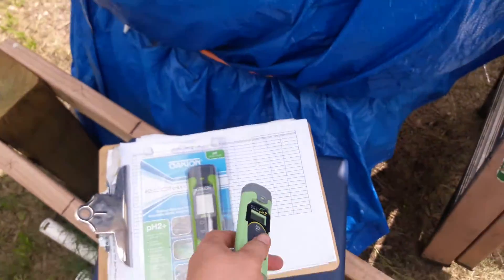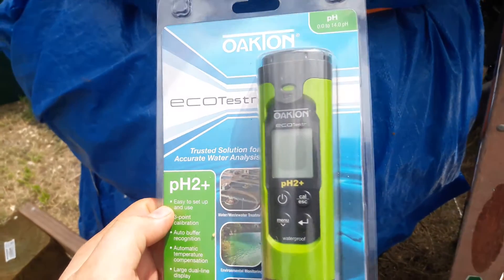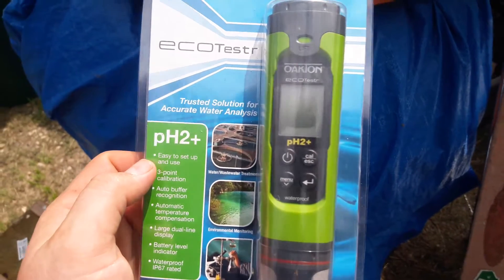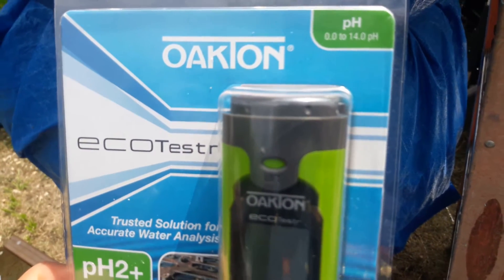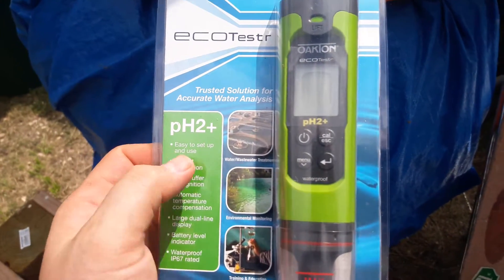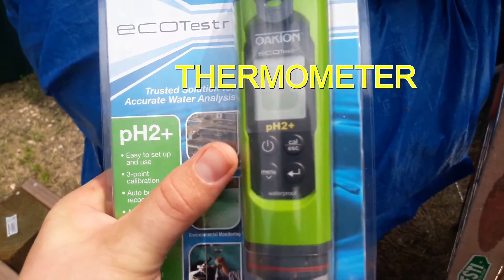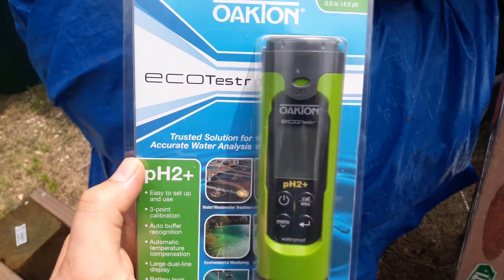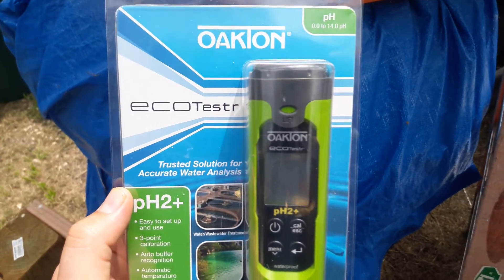We went ahead and picked this one up because it is the most comprehensive pH tester out there. They added features we could not live without — it actually incorporates two products in one. Not only does it have a pH tester from 0 to 14, it's also waterproof, and they added a temperature gauge as well. It also has three-point calibration at 4, 7, and 10, which is really nice.